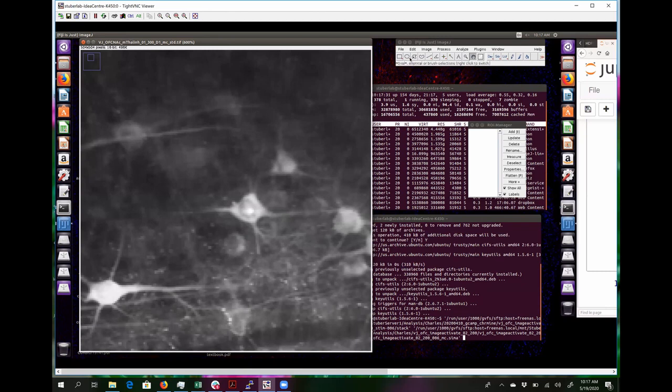All right, now let's draw that again. This time I'm going to go through it quickly. Let's say we draw this as our ROI. It looks pretty nice, and it covers the whole cell. Generally speaking, everything inside here is part of the cell, you would think. So you'd say this is a pretty good ROI.